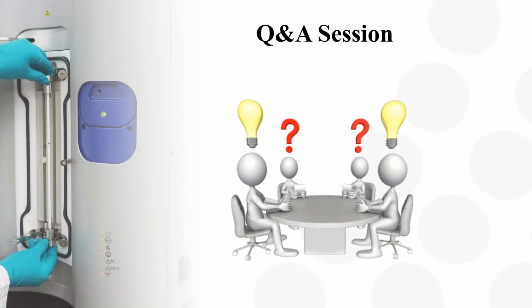Certainly, yes. We did a few studies on metal powders, and we got very nice results. So we can determine surface area as low as 0.05 meter square per gram. So we can go really down in the surface area range. Due to the pulse injection, our instrument has a higher limit in surface area, but on the lower end, there's no limit. So far, we haven't experienced a lower limit.